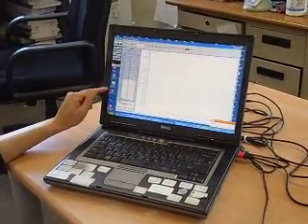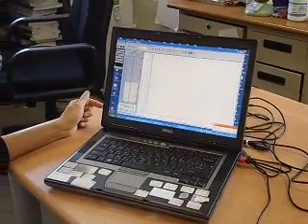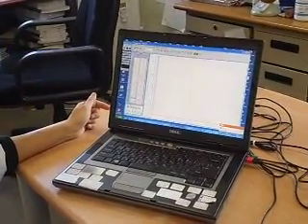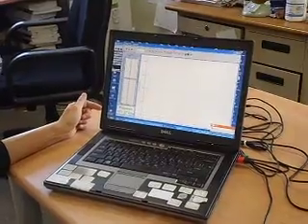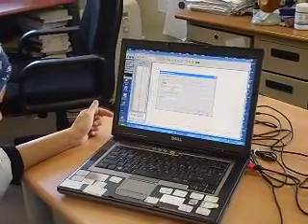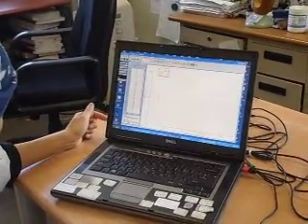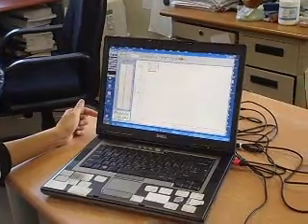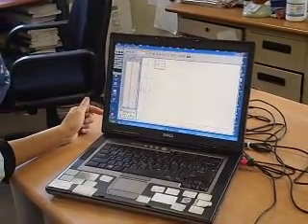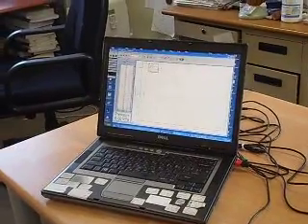So I'm going to look for 44 seconds. So this is at 44 seconds. This part here, 44 seconds. So I'm going to look for 44 seconds. Okay. So this is 44 seconds.